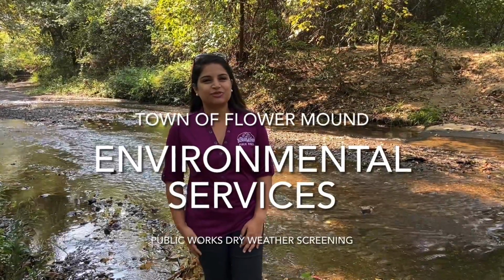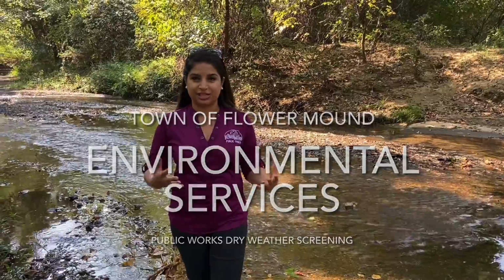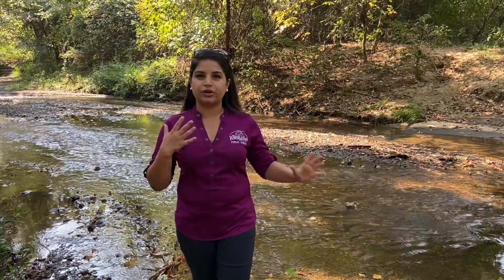Hi, my name is Suva Pandey and I'm a Stormwater Analyst with the Department of Public Works here in Flower Mound. And today we're going to go over how we conduct a sampling event for a typical dry weather screening.